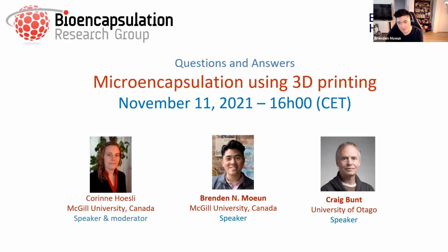But definitely something we can look at. And yes, we've only been looking at the performance of our inks using viability. We've actually not shown here, but we've cultured cells that have been 3D printed in some of our inks for multiple days and see some pretty good viability and functional data as well.